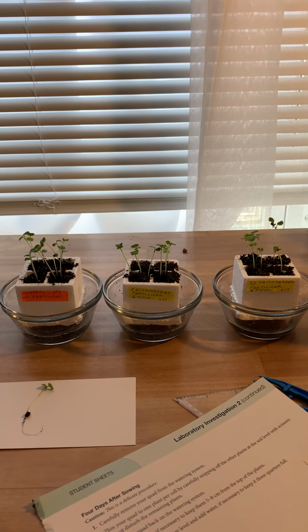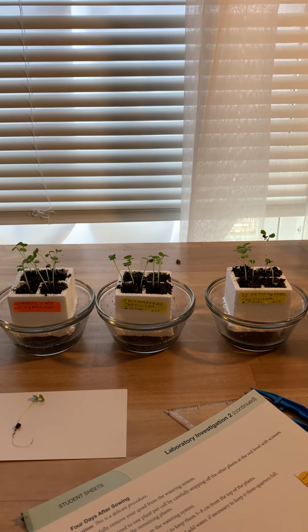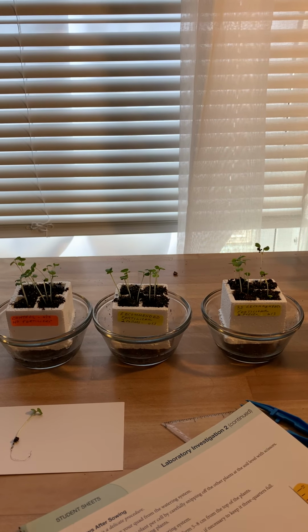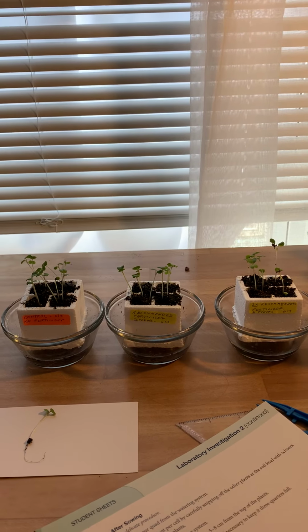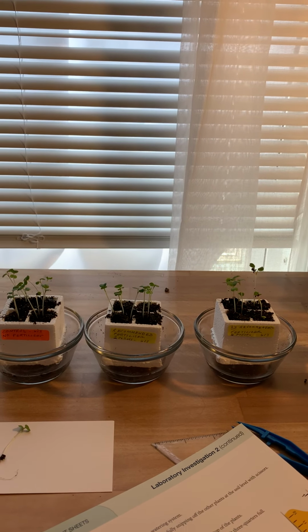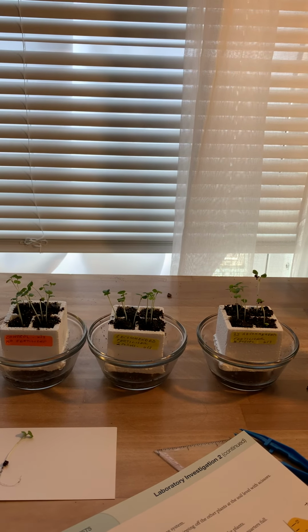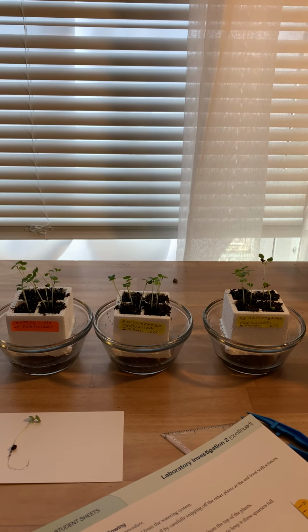So to have a more random approach, I'm going to eyeball the plants in each hole and take out whichever one seems to be intermediate. And if there's only 2, I'm going to try to choose at random the best ones to remove. This is never going to be perfect, but we're just going to do the best we can to avoid bias.